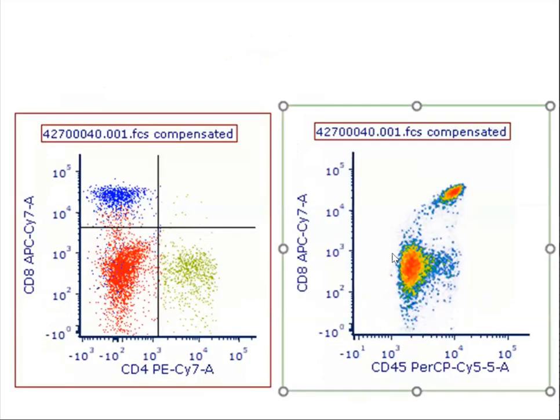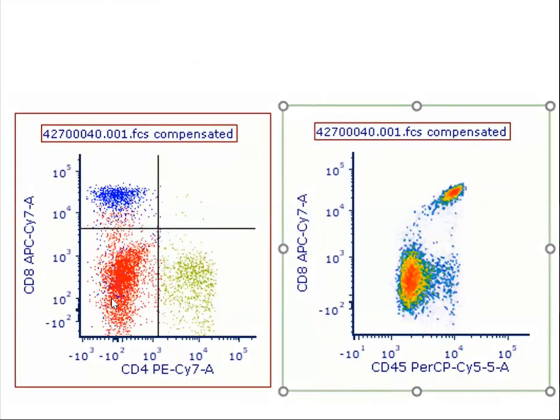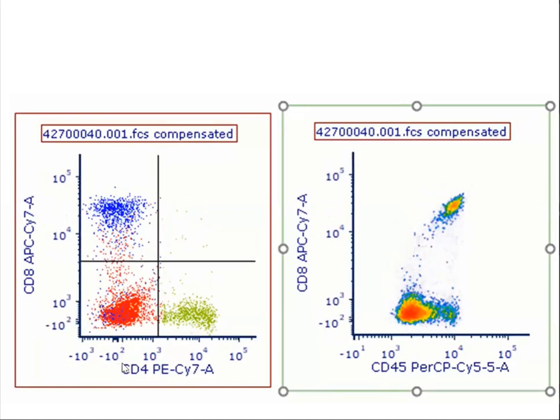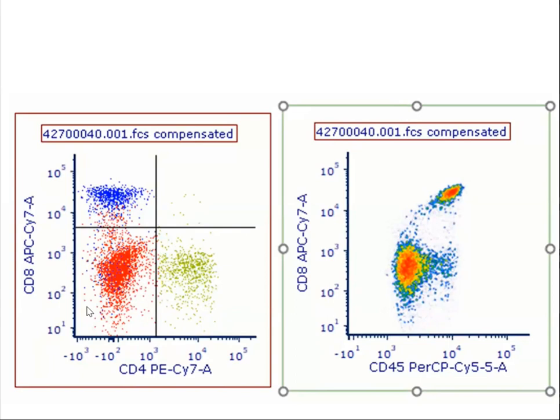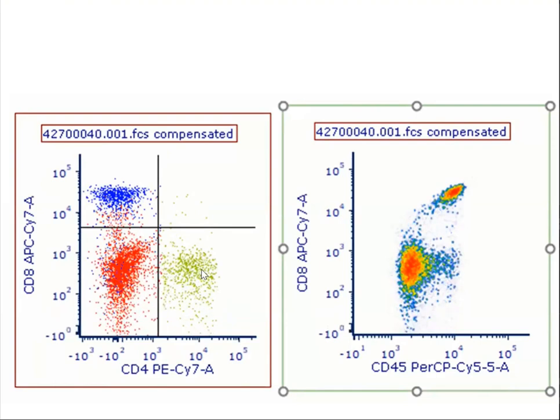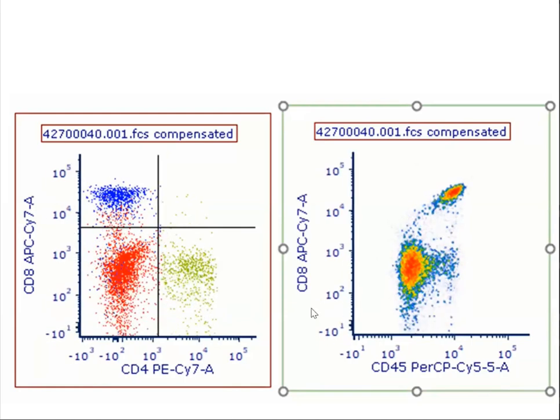See now, this is a logarithmic scale. Your software is well equipped. So if you just select and drag, all the population will come inside. This is a classic logicle scale, and this is how we adjust. There is a population which has been buried. What I need to do, see, just check my cursor. If I pull it like this, all the population will come inside. If I'm pulling upwards, all the population will come up. I'll show you during the analysis, just remind me. That's how you need to pull the population inside. So this is a typical bi-exponential scale.